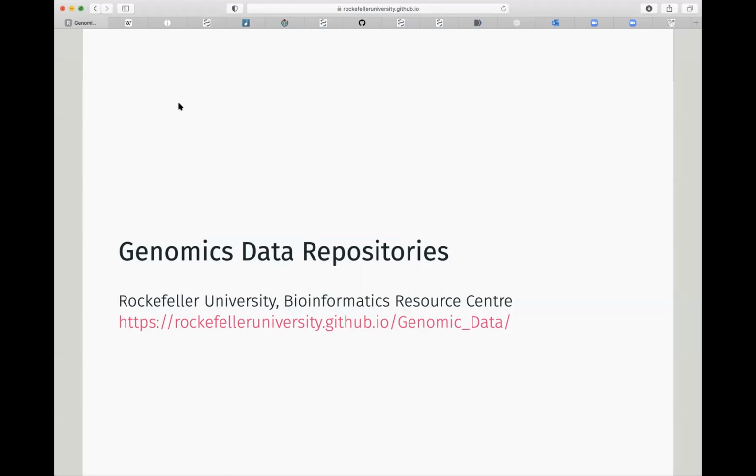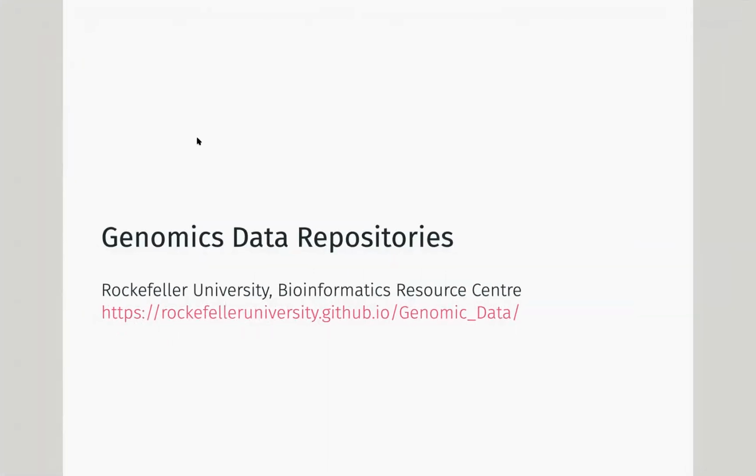So we should have covered most of the genomic data types we're going to handle. And as we go through the rest of these courses, we are going to come across them. So we're going to learn, first off in our next session, how to just look at them in IGV, a linear genome browser. And then we're going to look at how we can read them into R. We have special structures, like lists and data frames. We have special structures to handle BED files, BAM files, etc.